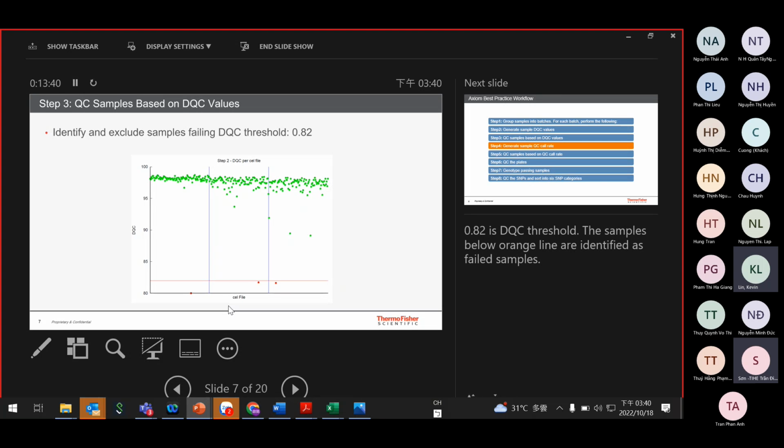Control probes. You already know the genotype and you never change in samples. Yeah, for this case, so validate.